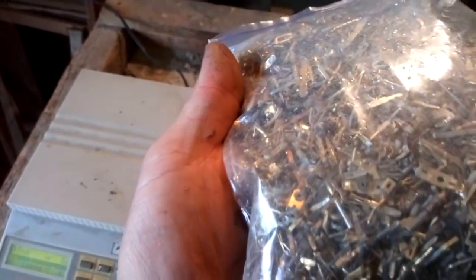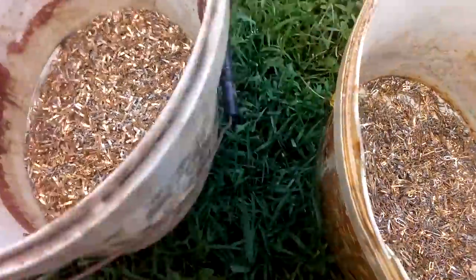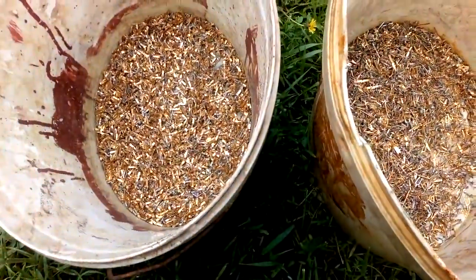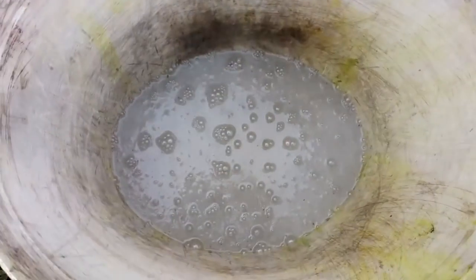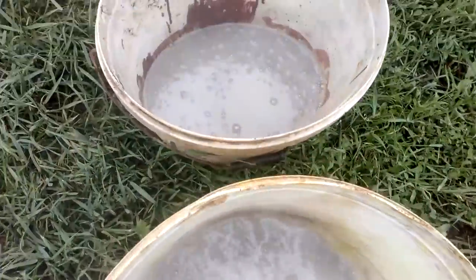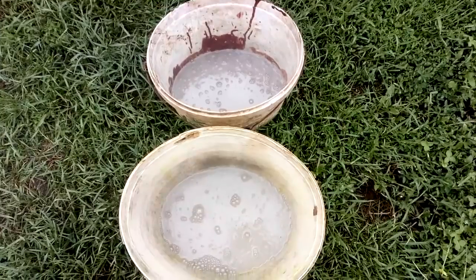Now we go to remove that solder with HCl, then we'll put that in the nitric acid. We got two buckets — this is all the same pins and this is our mixer pins. Now we gonna add some HCl to remove that solder because both of them got a lot of solder. We add HCl and you see the reaction starts immediately — HCL starts to dissolve all that lead. We're gonna leave that for maybe an hour or two.